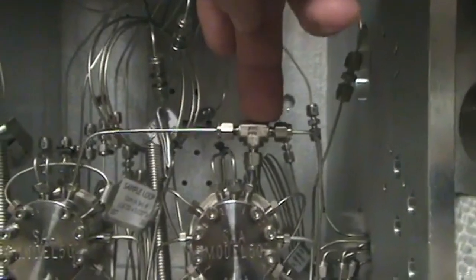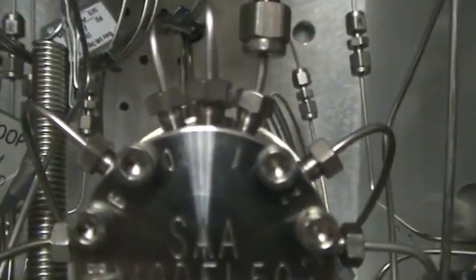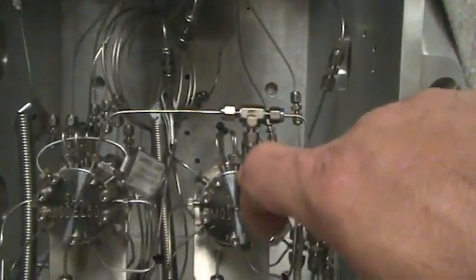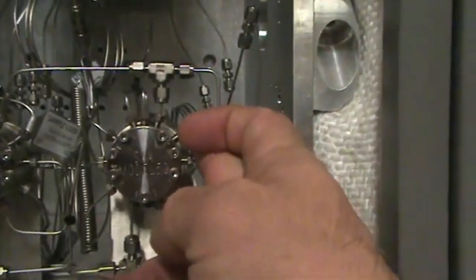So this is your sample coming in, and we're going to parallel feed the sample in on 1. Do you see your number 1? Internally, we're going to fill it to 2, and then it goes to the sample loop.